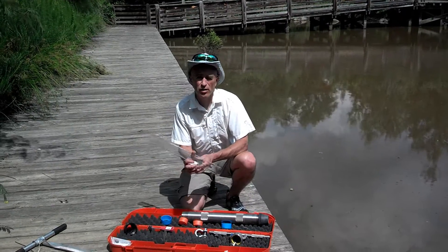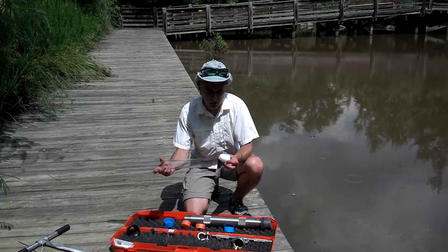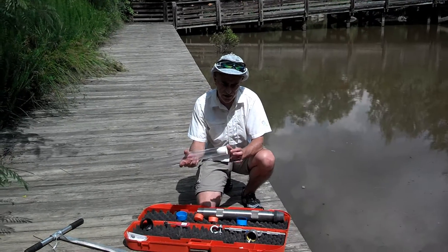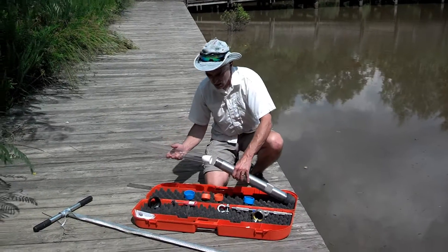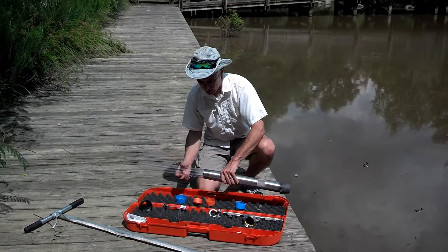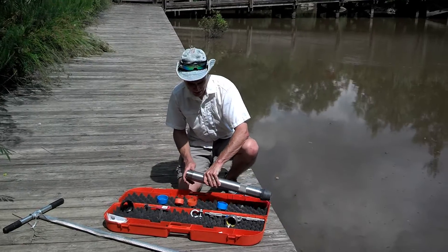Next, we have the corer tube. This is plastic, and we'll put a cork catcher in the end of that, which will help prevent the sediment from coming out the bottom end. We're going to insert this into the corer barrel against the cutting head.